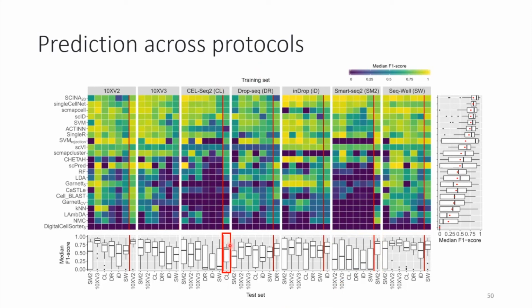Can I ask a question regarding the SmartSeq here? How is it normalized? Is it TPMs or counts? Yeah, good point. It is TPM, and then we just do the log normalization. So that can definitely be a problem that you should treat this differently. Our argument was that if I have an atlas, then I should not have to make these choices. But you're absolutely right. Still, TPM should be the most similar to UMI, so that makes sense.